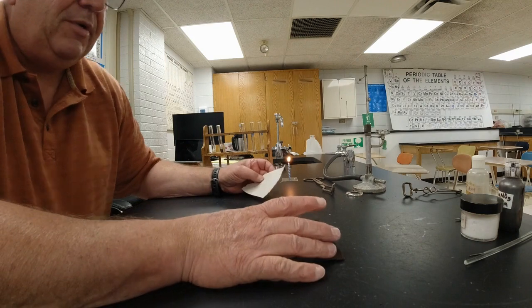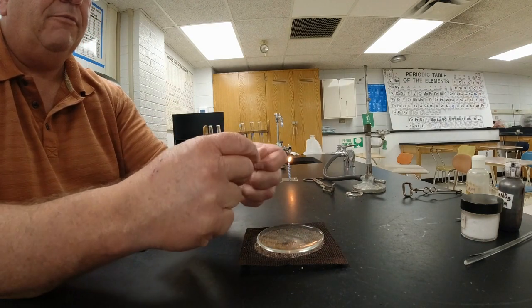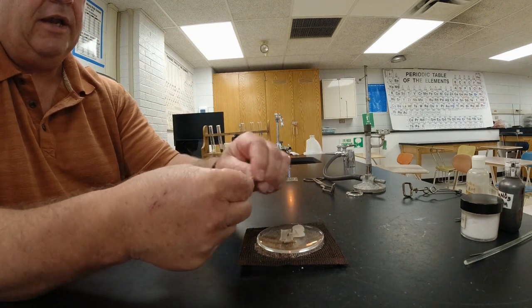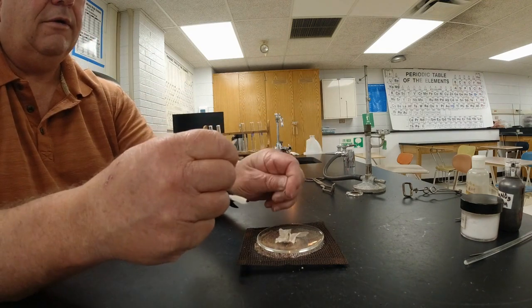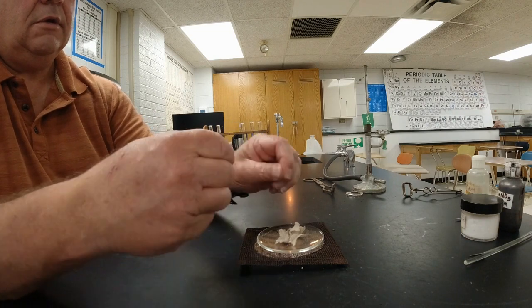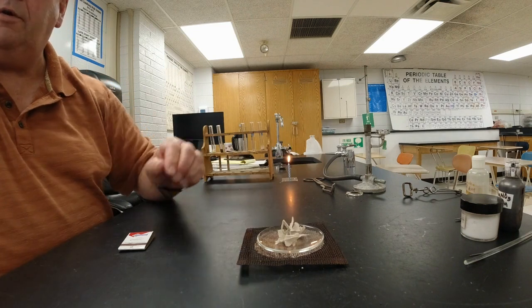Probably nothing would happen here, all right? But I'm going to tear up some little pieces of paper towel and wad them up and put them on here. I'm tearing the paper towel. I'm wadding it up. All right, that should do.